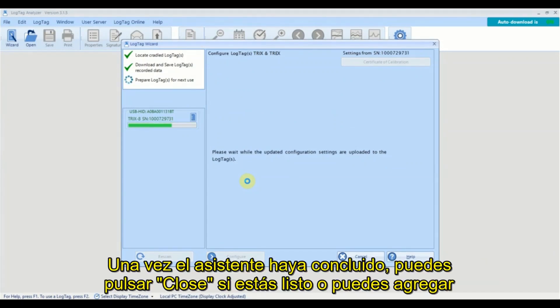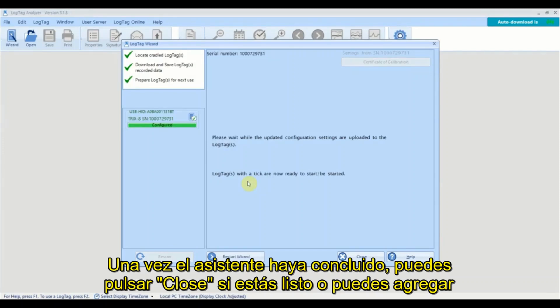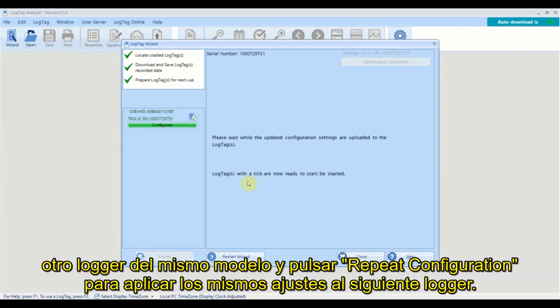Once the wizard has finished, you can click close if you are done or you can insert another logger of the same model and click repeat configuration to apply the same settings to the next logger.